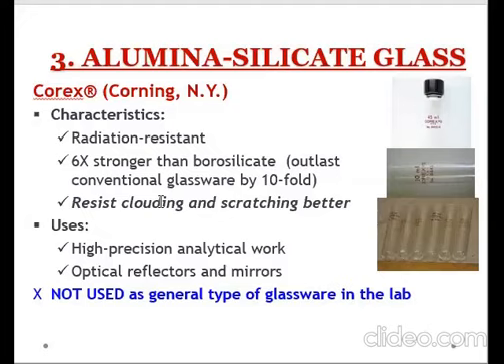Okay? So, precaution lang. It should not be used as a general type of glassware in the laboratory. Okay? Kasi hindi siya pwedeng incorporate lang sa kahit anong laboratory instrument. No? Kasi bakit? Mas expensive.